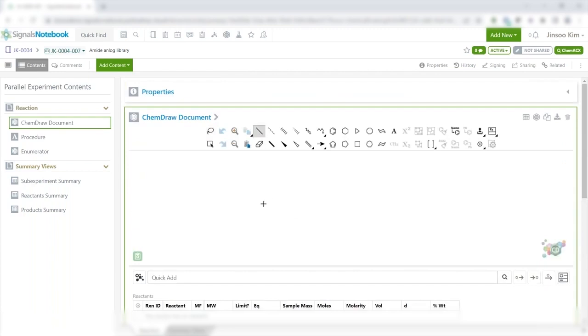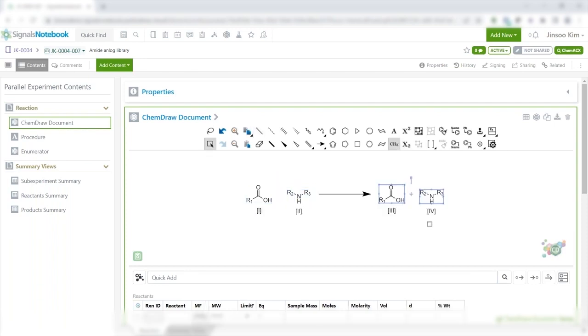So in the example that I showed earlier, I was talking through an amide coupling, and I said, what happens when you're using that amide coupling over and over, but you're modifying the substrates a little bit? You're generating a novel library of compounds. What you can actually do here is create R groups. And so I'll start there with my carboxylic acid, and then we will put our amine in here, R3, there we go, create a reaction.